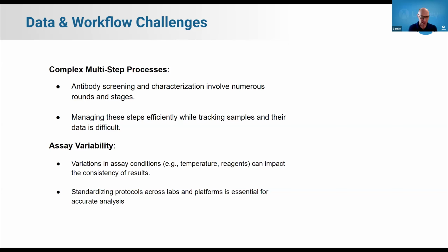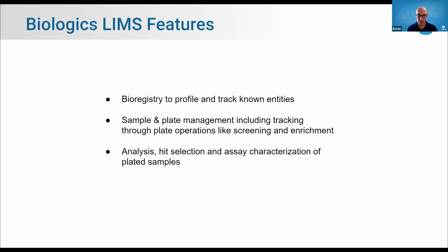And then assay variability. There are, of course, variations in assay conditions that can impact the consistency of results. And so it can be really valuable to standardize protocols, standardize data shapes across labs, across groups, across projects to help ensure accurate analysis. Okay, I hope that has set a reasonable stage for what I'll be showing you today.